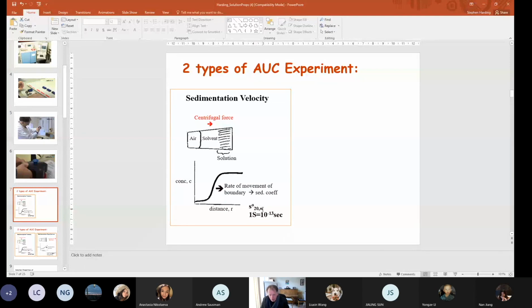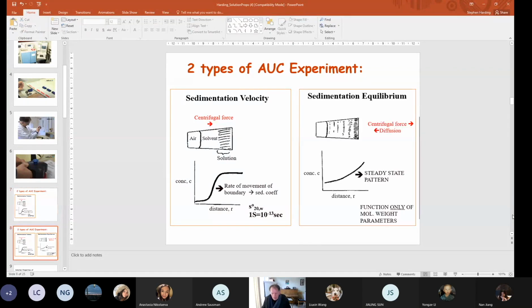There are special formulae which allow us to convert our sedimentation coefficient, measured in a particular buffer or in glycerol or something, to standard conditions, which is the density and viscosity of water at 20 degrees centigrade. Typically an IgG antibody would have a sedimentation coefficient of between 6 and 7 Svedbergs.